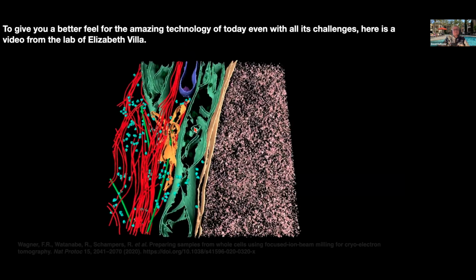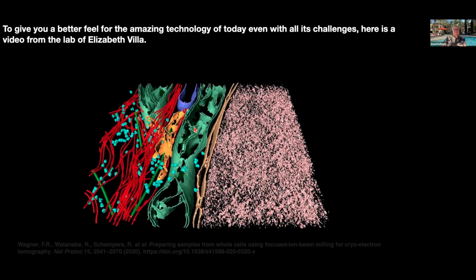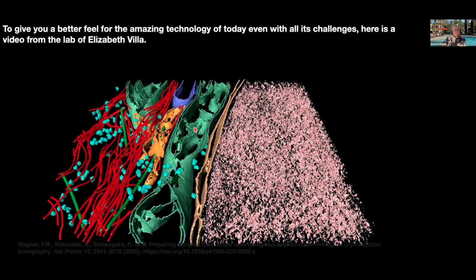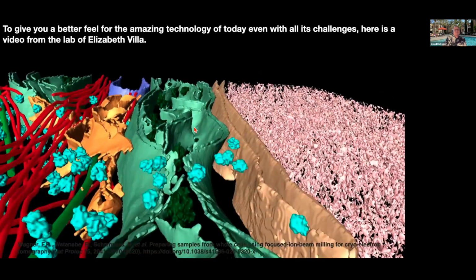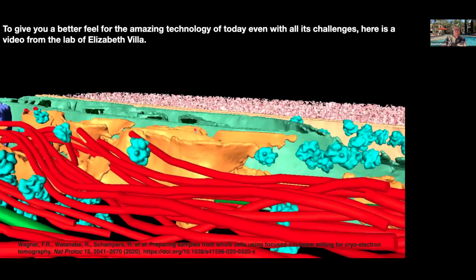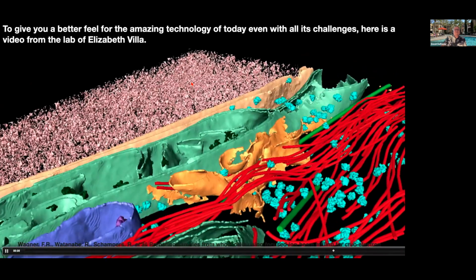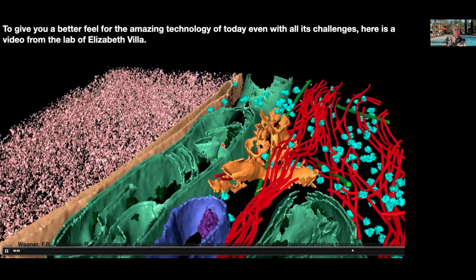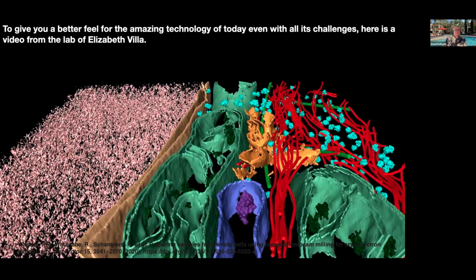So you can see the stunning image detail that's available in tomograms. You can see membranes, you can see the nucleus, which is here, the nuclear membrane. Here's the inside of the nucleus. Here's a mitochondrion. Here are filaments, ribosomes, and so on. It's really quite exciting.